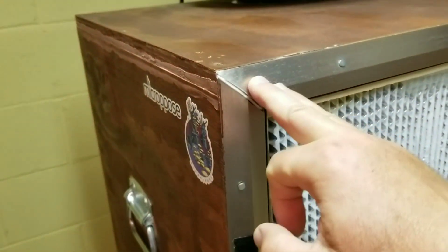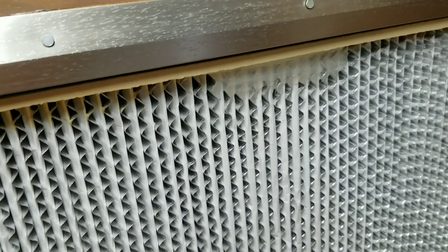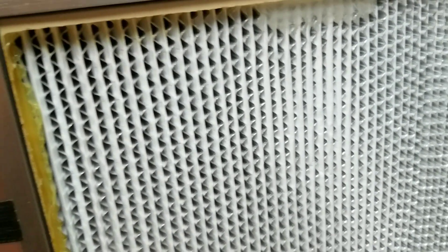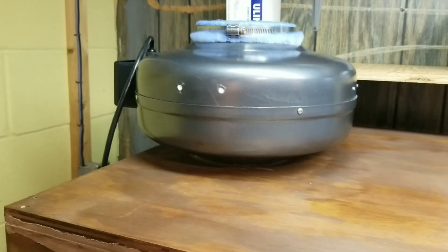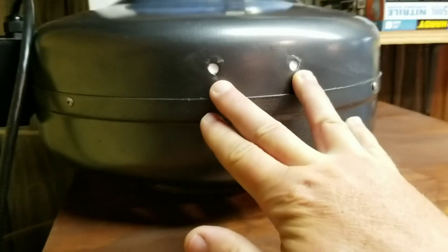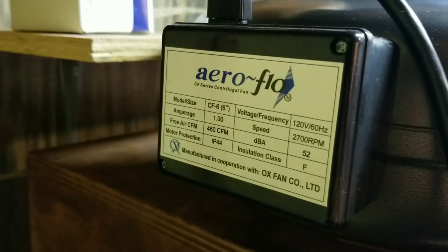Everything got siliconed up real well. And then I just put door trim around it after I siliconed it all up to make a nice clean edge. You can see when I first got my filter, it had a little battle damage up there at the top, so I just siliconed that up and it's worked fine. Look at the fan here — a lot of people use like a squirrel cage blower, like a furnace blower. I was looking at those but at the time I had trouble finding them and they were more expensive. These were just cheaper. It had a couple mounting holes on the side of the fan housing and I just siliconed those up.